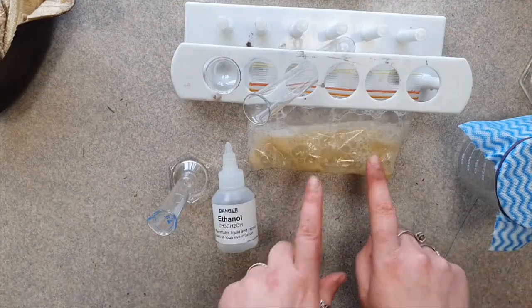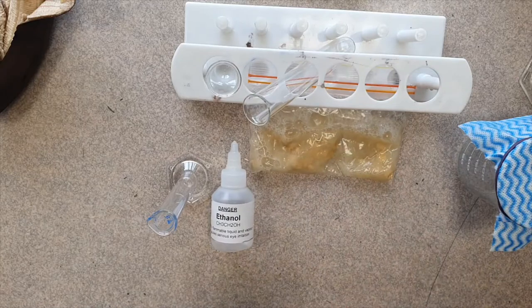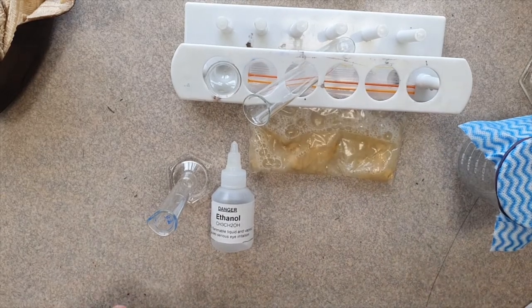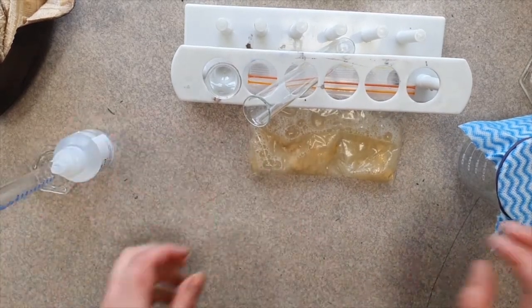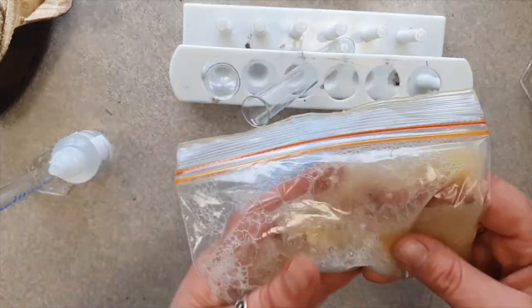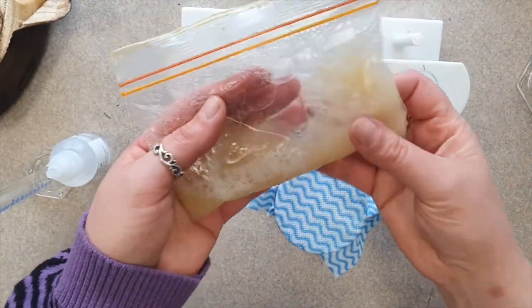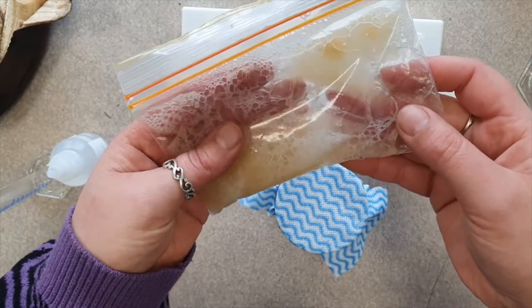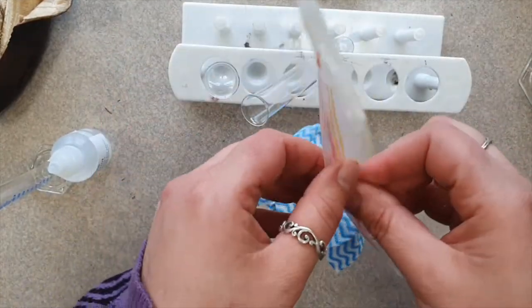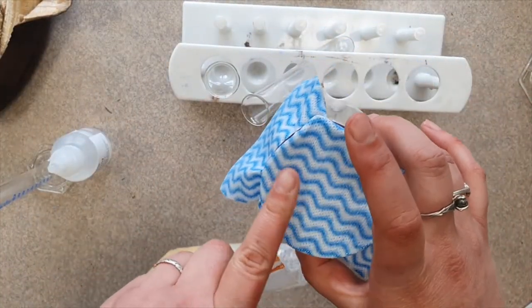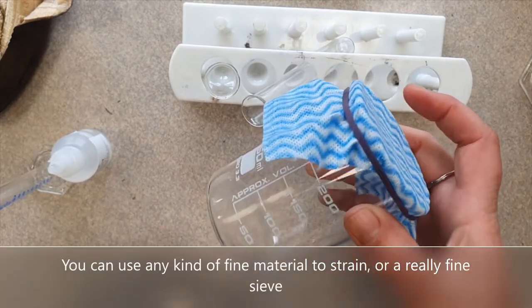So there we have nice mushy banana, and the next step is we want to strain this to get rid of all the chunks because we want to just work with a nice thin solution. So I'm just going to, I've got a beaker here with some chux over the top to strain it. You can do that at home with just a cup.